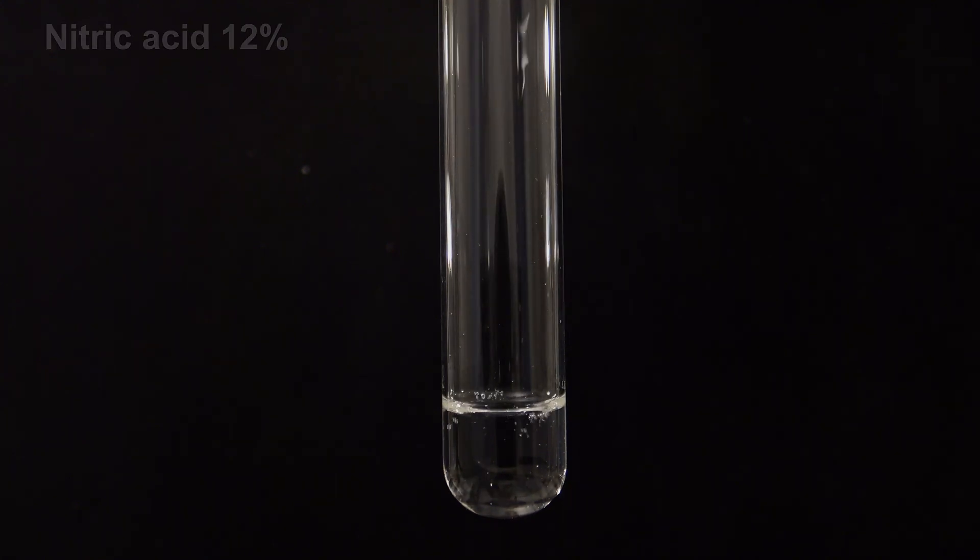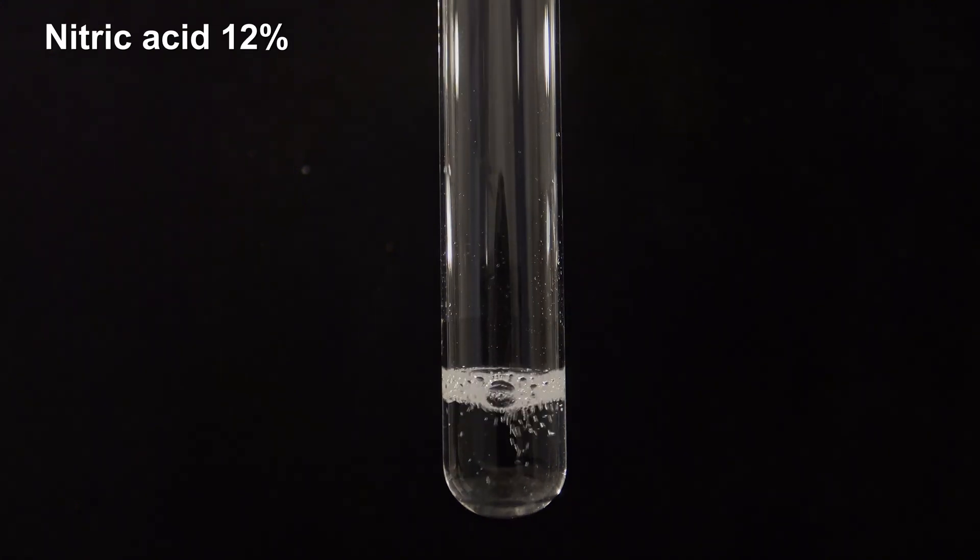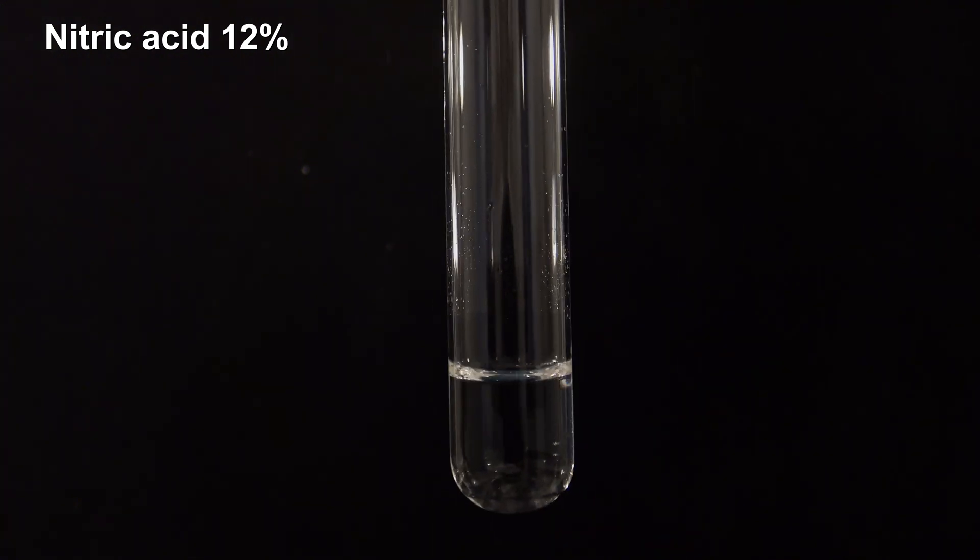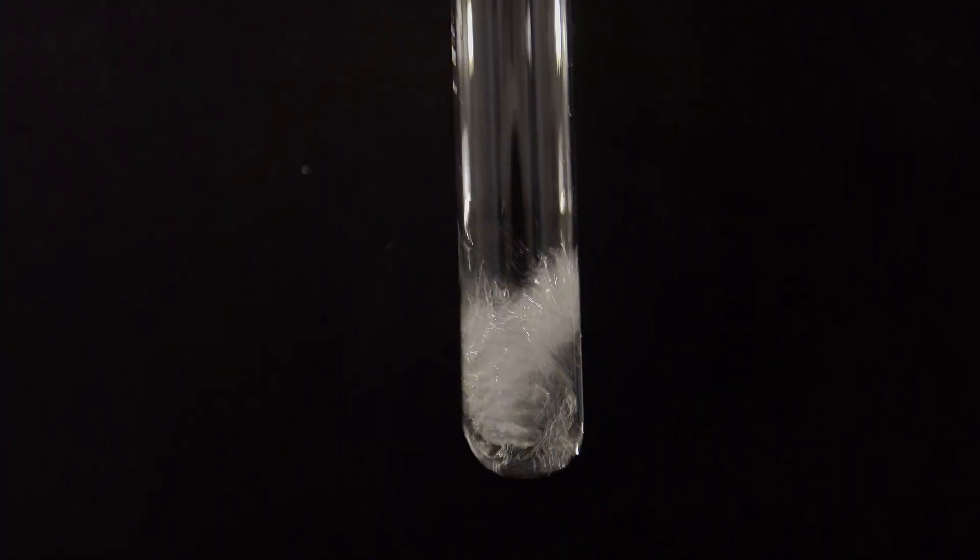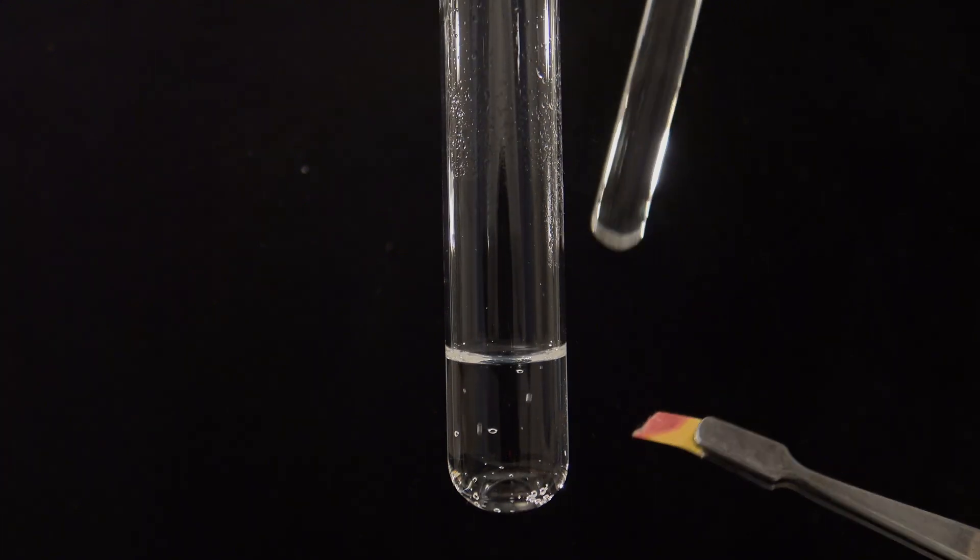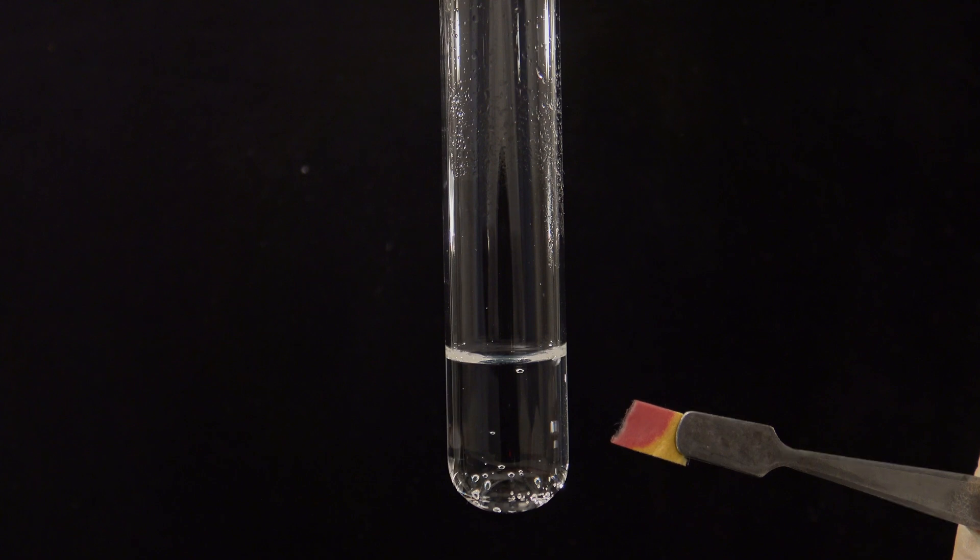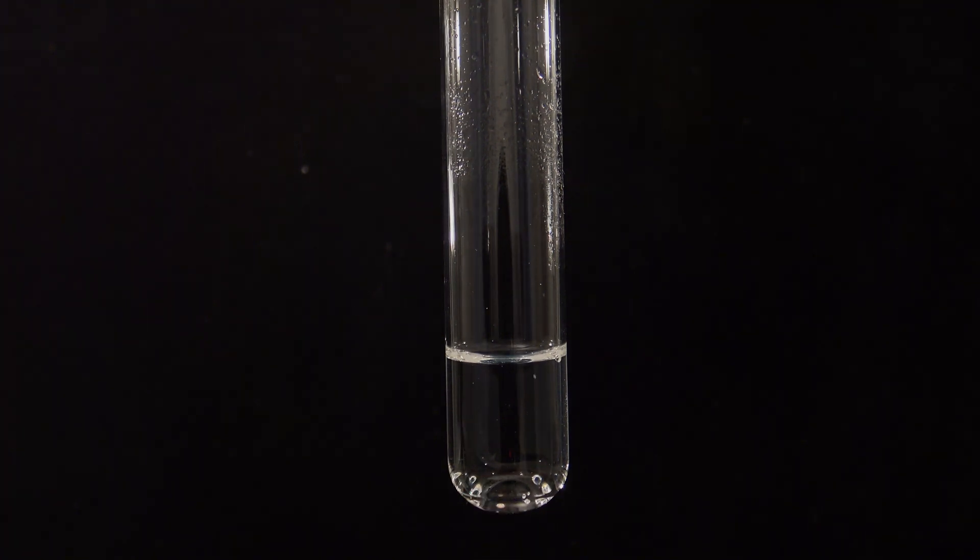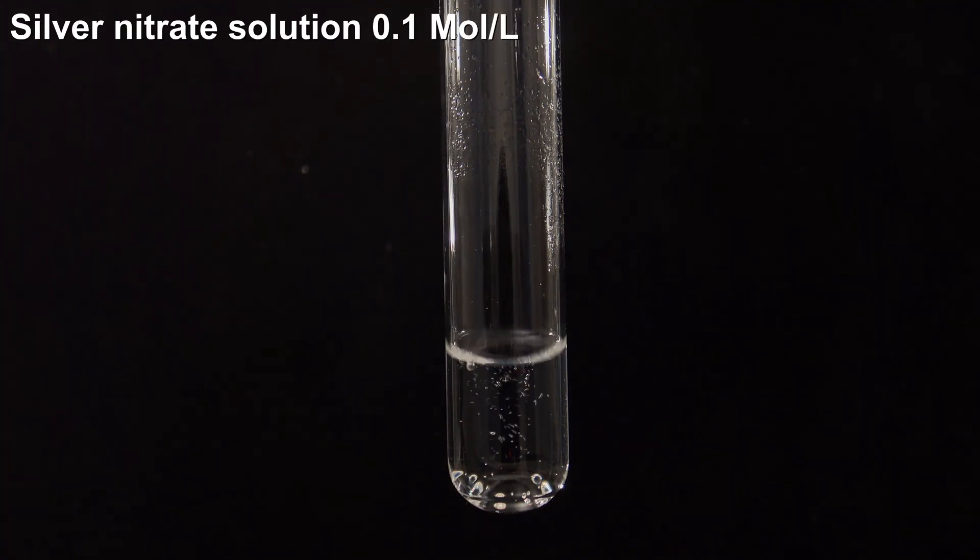For the first test, a sample of the soda extract was acidified with diluted nitric acid that had a concentration of 12%. Next, a 0.1 molar solution of silver nitrate was added.